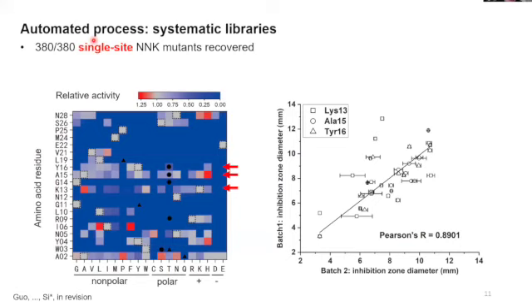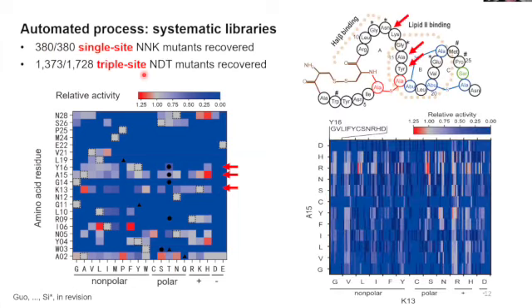Using this process, we have comprehensive library coverage of the single sites, and then we go ahead to target some of the mutation-tolerant residues and do combinatorial mutagenesis. Again, we create the library, scan the mutants, use sequencing to tell them apart, and get the sequence-activity map again. From there, we could isolate some improved variants. So that's our first example.